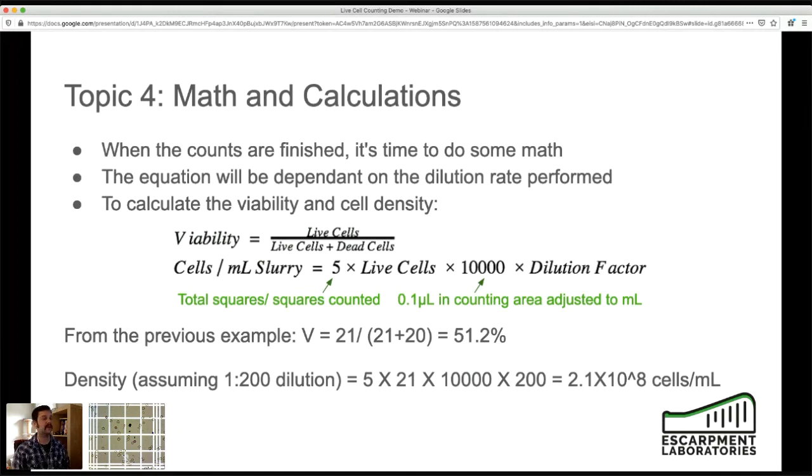Now, if we want to calculate our density, which is cells per milliliter of slurry, we do 5. This is a simplified formula. If you want a full breakdown of the formula, I think it's covered on the Braukaiser blog, and the yeast book by Chris White also covers this formula. It's all over the place, you can easily find it. This is a simplified formula, so you're literally just plugging in blanks.